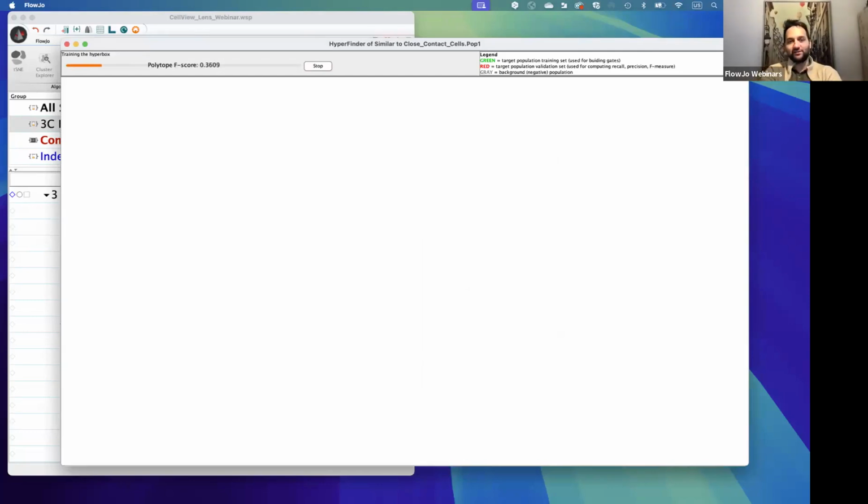Tarsana asks another difficult question. If we don't know the number of cells we want for nearest neighbors, will the algorithm try to fit the number we give? Yeah, I believe so. It could also be the case in my data set here that I forced it a bit. Previously, I tried it with 100 and it was okay. With 150, yeah. If you overdo it, it will find more dissimilar events.